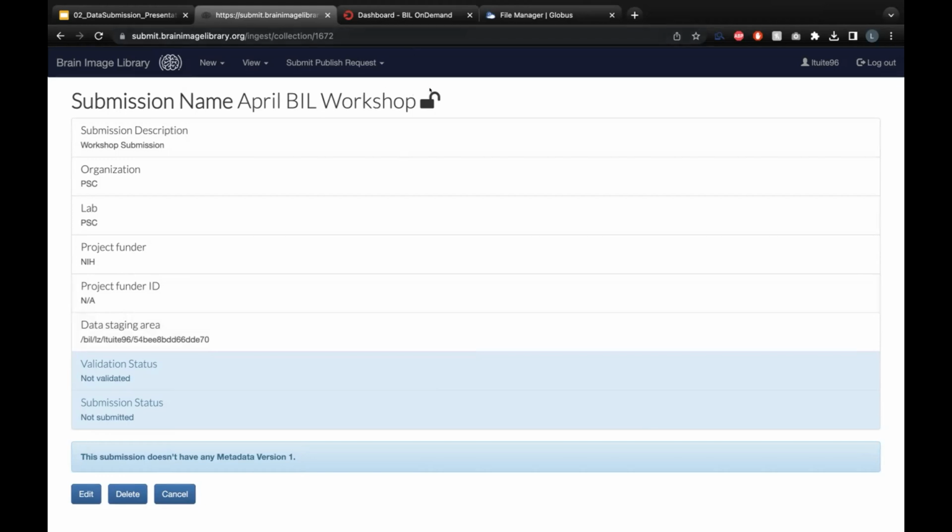I already have a submission in progress. Should I still create a workshop submission, or can I play along with my existing submission? It's up to you. We're just going to do a kind of dummy upload to a dummy submission later on. Okay. There's data moving now, so that's okay. So if you already know that, Katie, you can follow along as much as you want. Thanks.